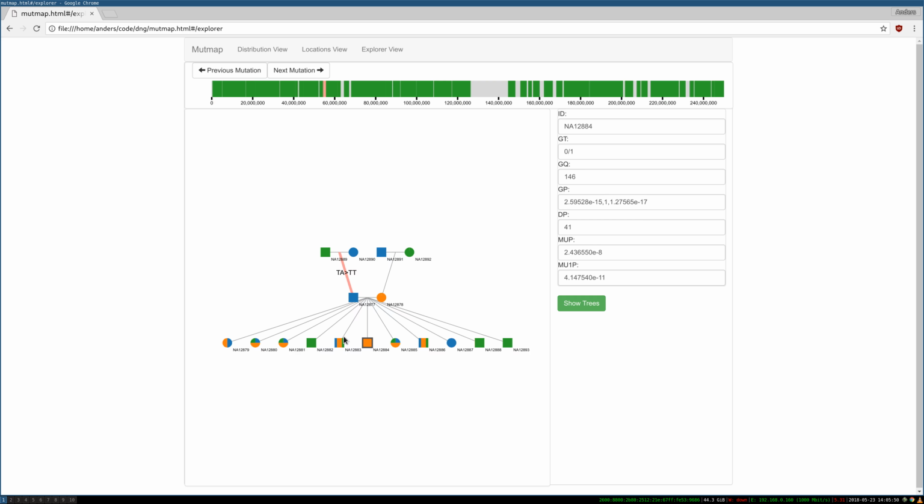However, if you go back to this node, you can see that there are 3 different bars that are significantly sized. Although the orange is the largest, the green and blue still have about 25% probability. The blue represents that it's reference only, so if the reference is A, this would be AA. The orange means that the reference is included, so that could be AA, AC, AG, etc. And the green means that there's no reference at all, so GG, CC, TT, GC, etc.